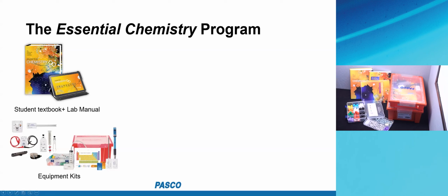We're not going to be able to cover the distiller. We may get to conductivity if we get to that. The physical or chemical change lab may or may not, but we are definitely using these 3 sensors today.